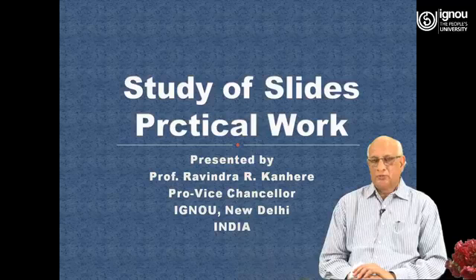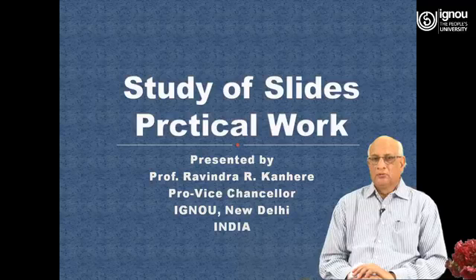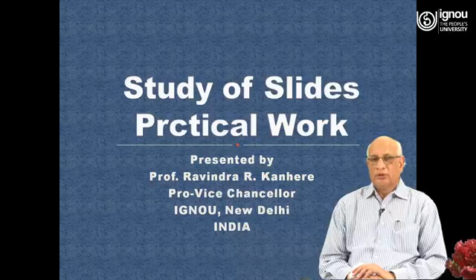So what is a student supposed to do? First of all, he should write the spot number, then study the slide very carefully in high power of the microscope. He should identify it, and after identification, he should write the classification of that particular specimen, if it is a protozoan, then characters of the specimen, any economic importance of that particular species, if it is pathogenic or non-pathogenic, what is the common name of the species, and the allotted time is only 3 minutes.